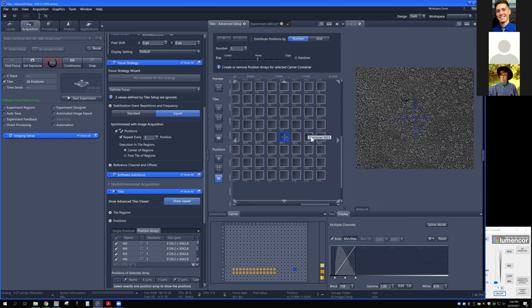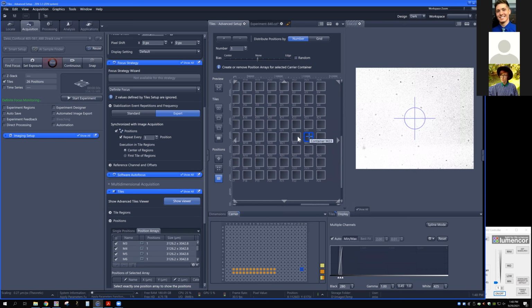Oh, there's something in everything. Maybe not here. No, yeah.